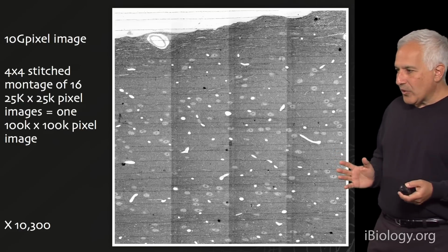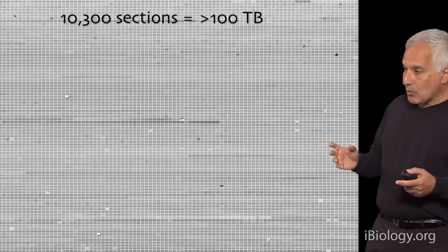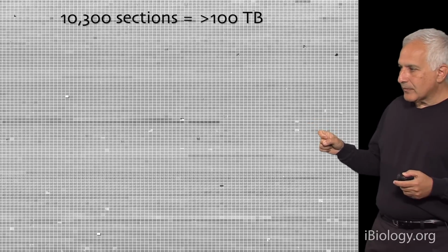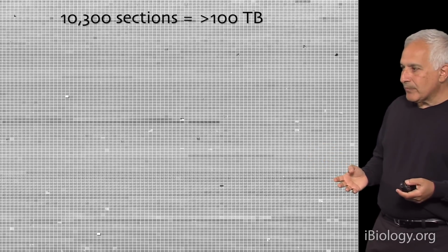I'd like to show you all the images, all 10,300 of them at once. I've got to make them very small to see them, but there's a point I'd like to show by doing that. And this is the 10,300 sections. This is more than 100 terabytes of data. And each of these little boxes is one 10 gigapixel image.